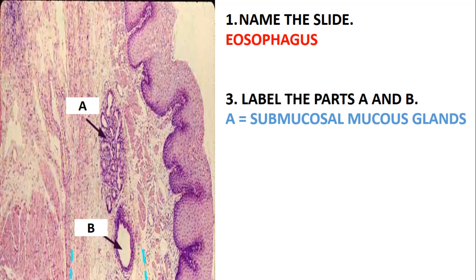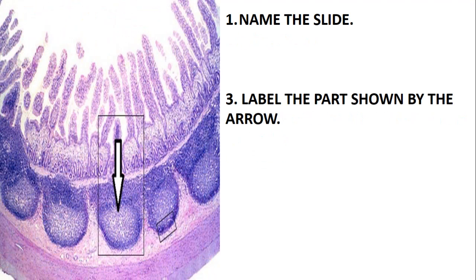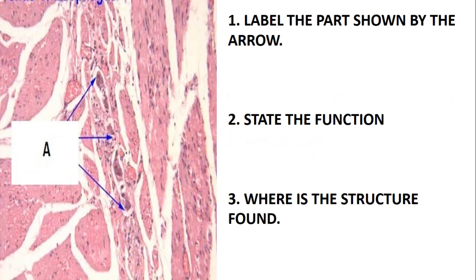Label the parts A and B. Part A is just the submucosal mucous glands, or you can just say the mucous glands. Part B is just the duct. Now, name this next slide. If you look at this slide, you can see those finger-like structures — there are a lot of them — so this slide is just the ileum.